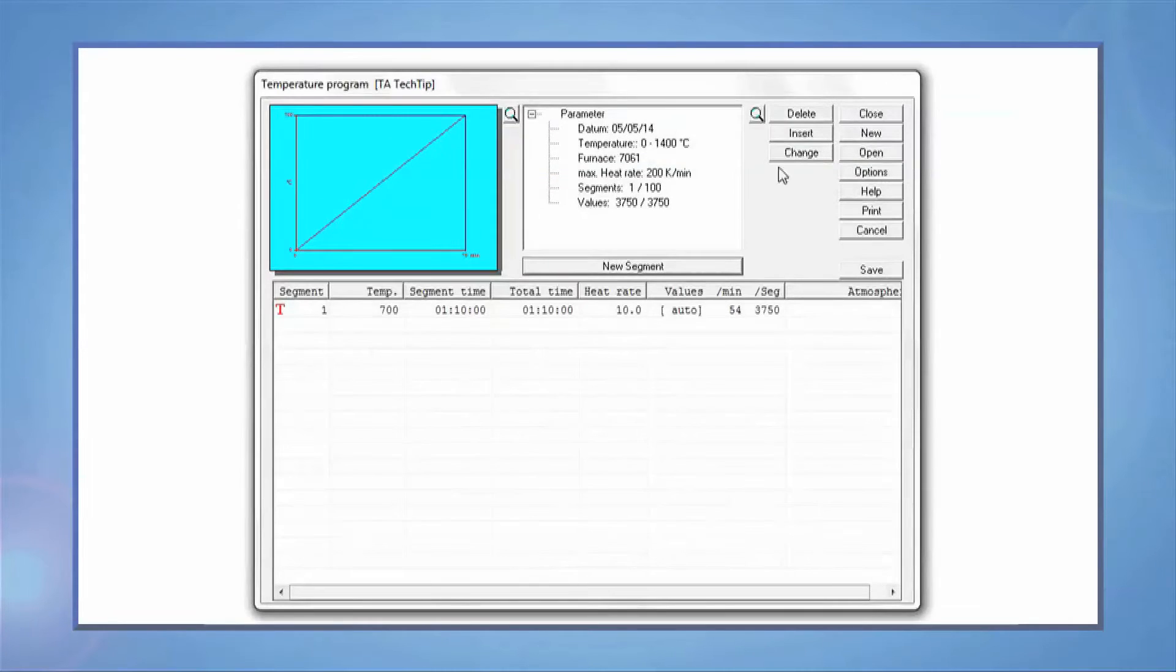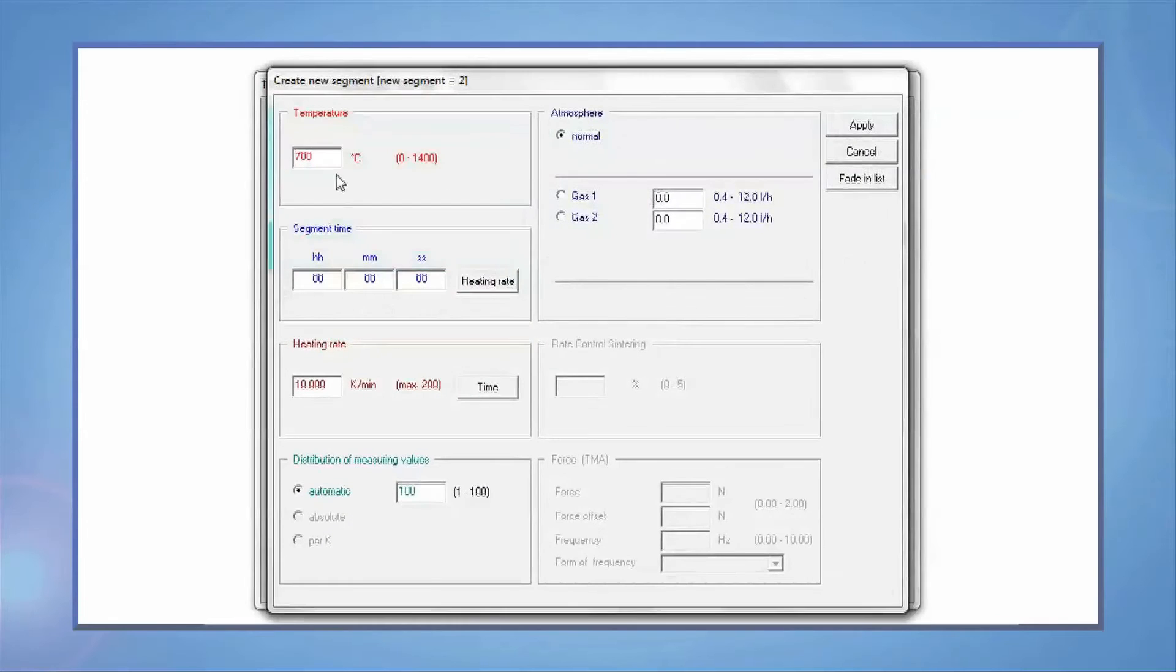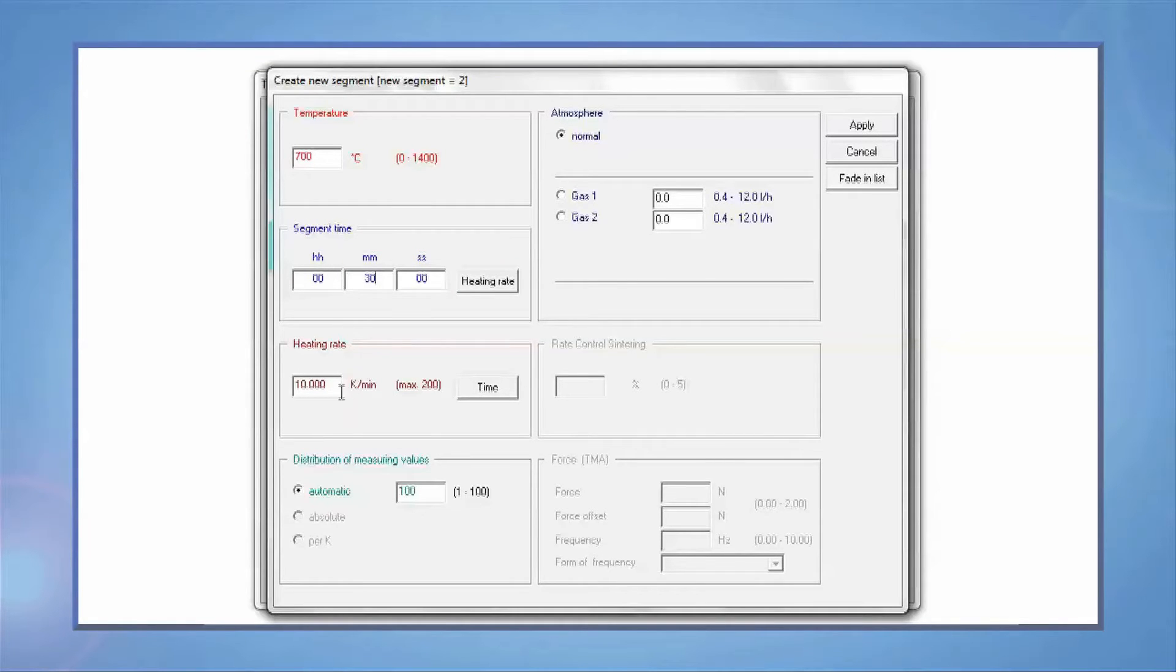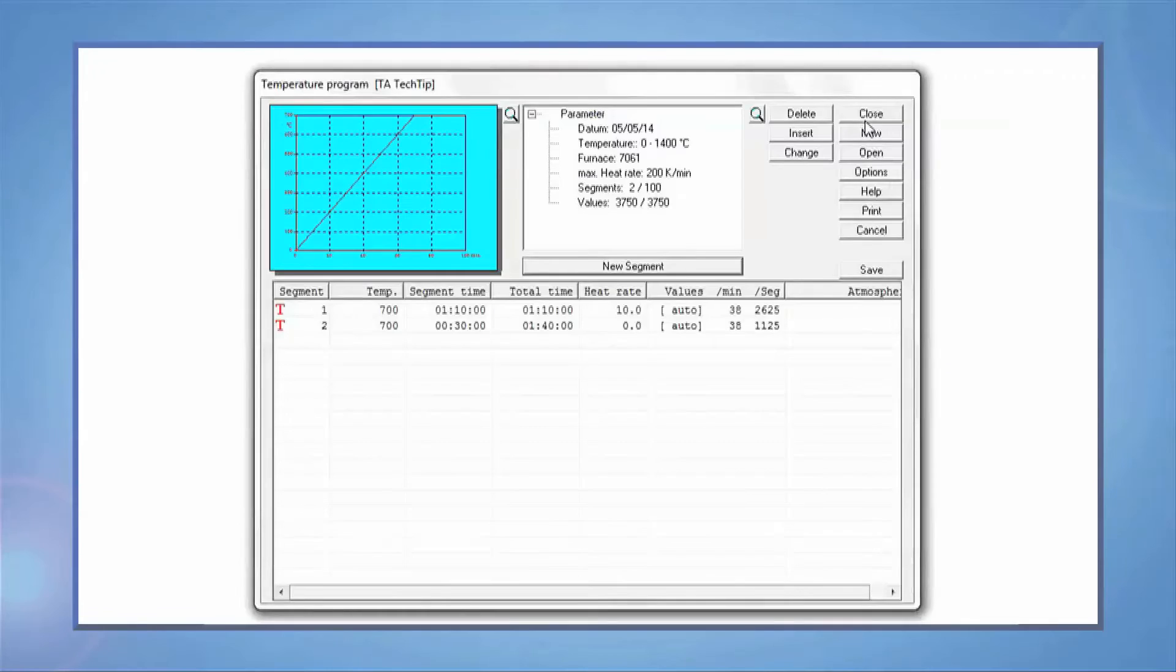If you need to run isothermal, that is also possible. Press New Segment and enter the amount of time you need and press the Time button to keep the heat rate at zero.